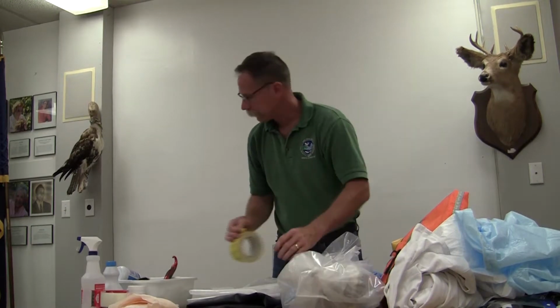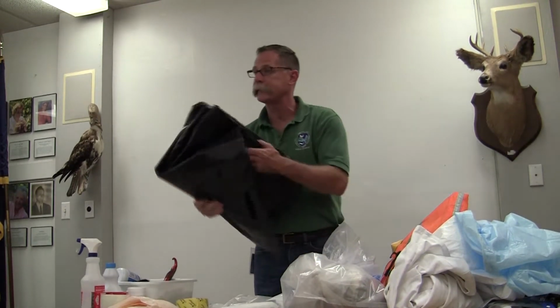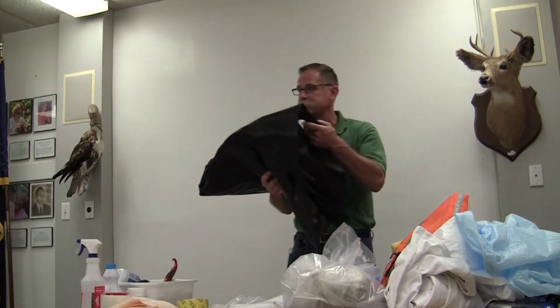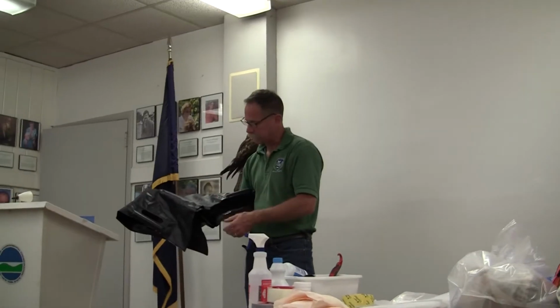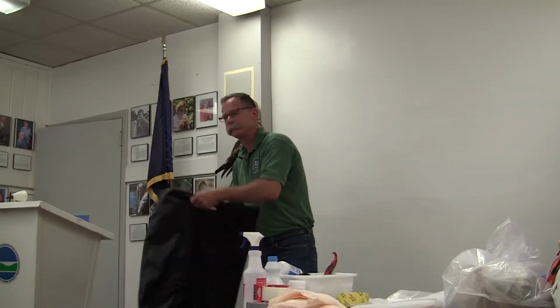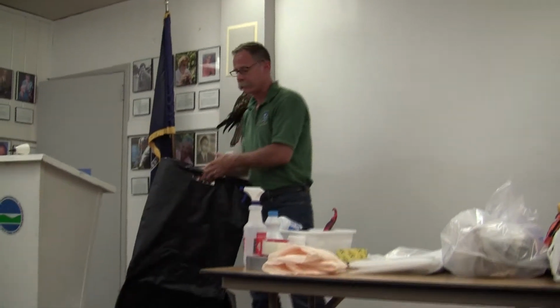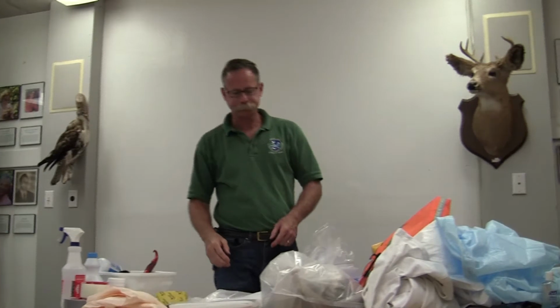And then it would go inside of a black body bag like this. If you had to drag it any distance, this gives you some abrasion resistance. Most gear will fit inside of these. Sometimes you have to cut the legs open before you put them in that bag. And these have handles on them, so you can drag them around. Two people can carry them, etc. We have a good supply of these in the lab if you want some.